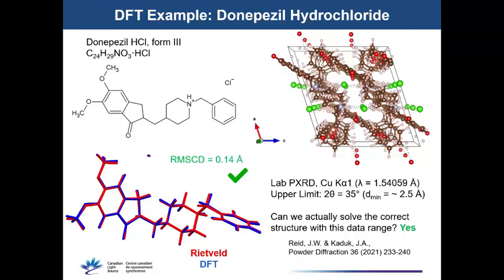And this shows you what you can do. Again, the DFT is very useful for helping describe the hydrogen bonding, and it even helps you decide what you think constitutes a hydrogen bond. You can use tools in the DFT like Mulliken overlap populations, which basically calculate the amount of electron overlap between different atoms, and this can help you decide what constitutes a hydrogen bond versus what doesn't.